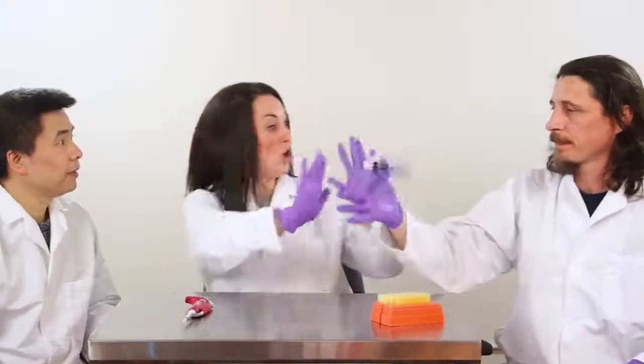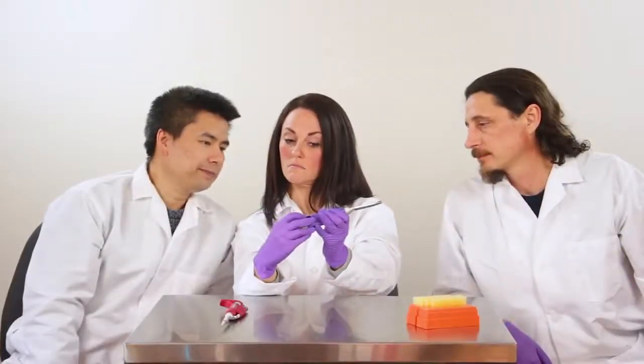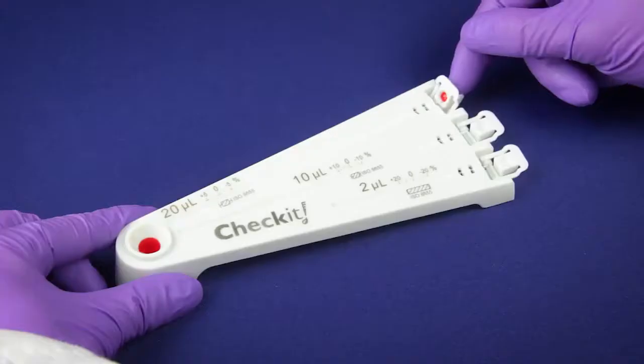Use it to perform checks regularly before there's a problem. You can even use it as a training tool to verify proper pipetting technique. So why take a chance when you're running an important assay with precious samples or expensive reagents?